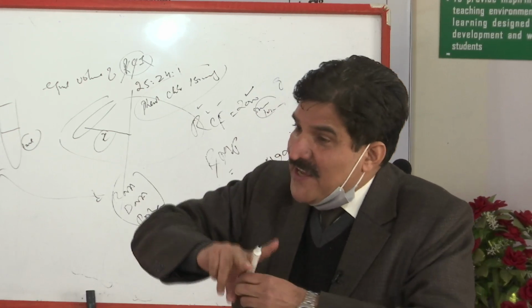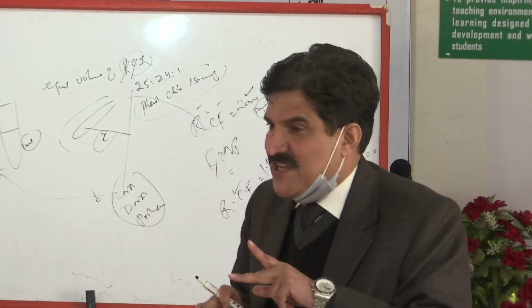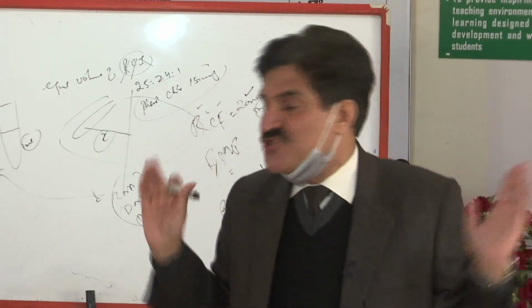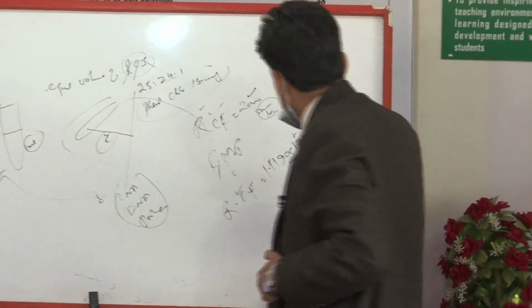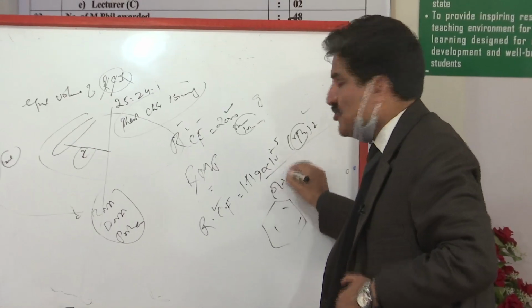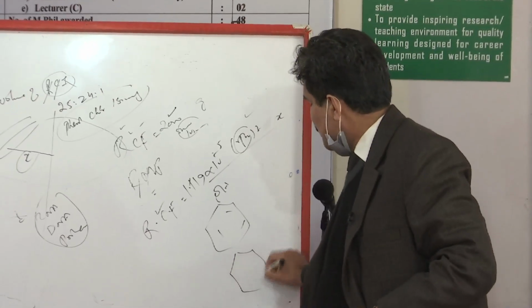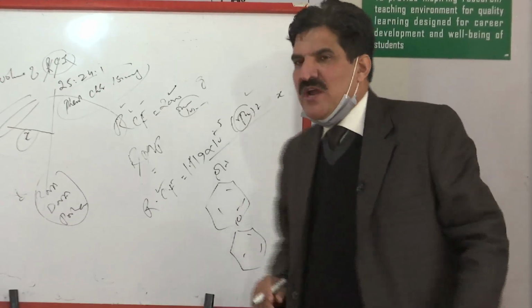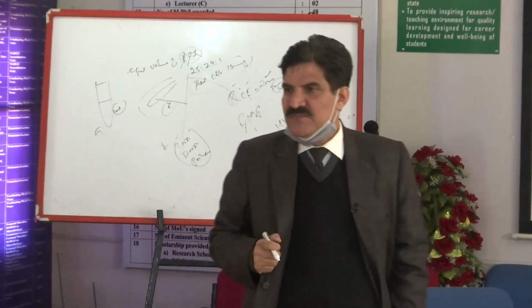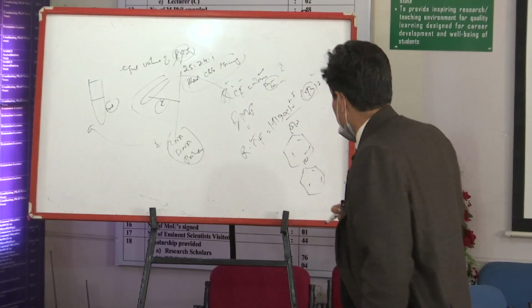Because RNA and DNA differ only in a little bit of solubility. Because of the hydrophobic benzene ring system, it is phenol. But it should not be used as plain phenol, it should be saturated phenol. When it is saturated with the buffer, it comes in the form of a phenolate structure, because it is forming a salt at a pH of 7, 7.4.